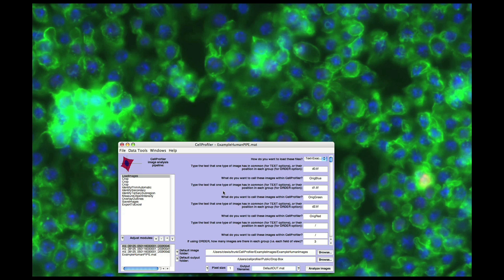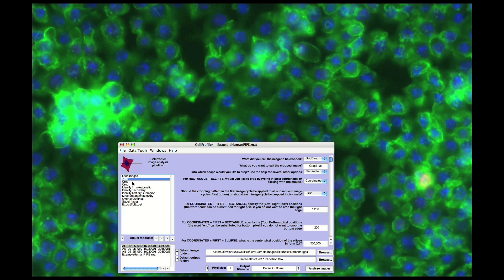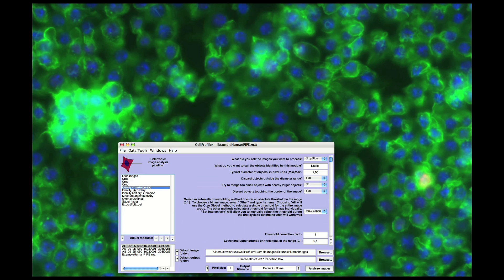For this particular dataset, we have displayed an analysis pipeline. A pipeline is a sequential set of individual image analysis modules. Each module performs a specific task, so by stringing them together in order, you have the capability of automatically analyzing your dataset.